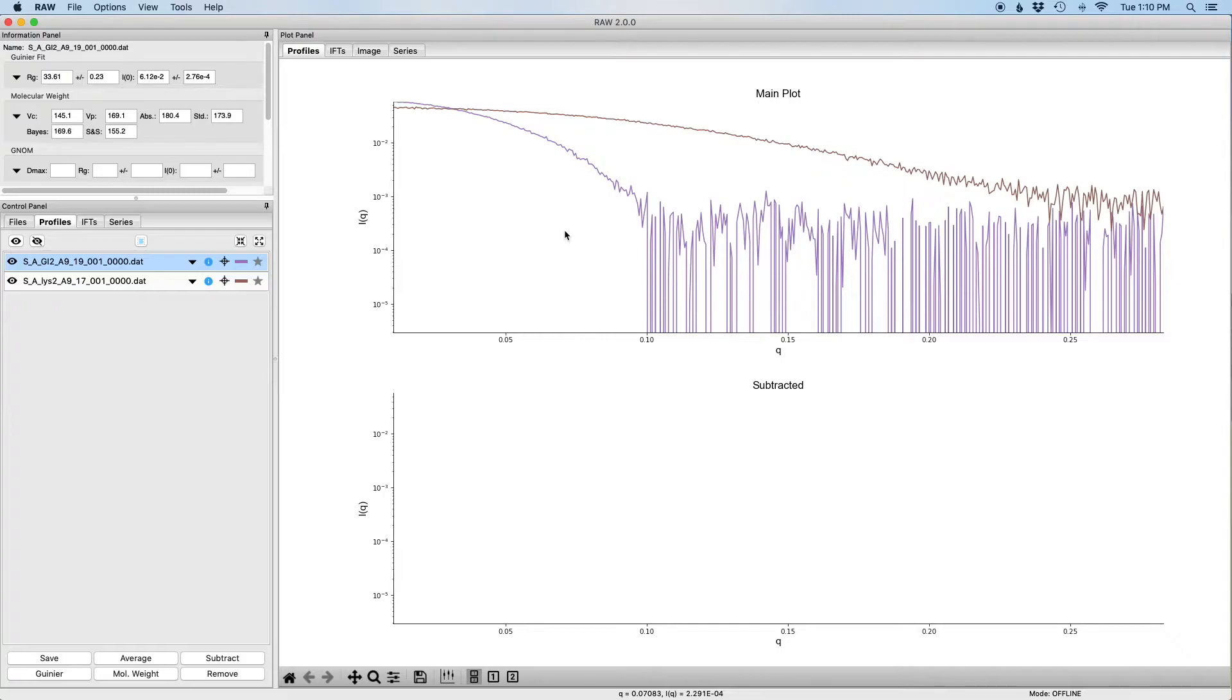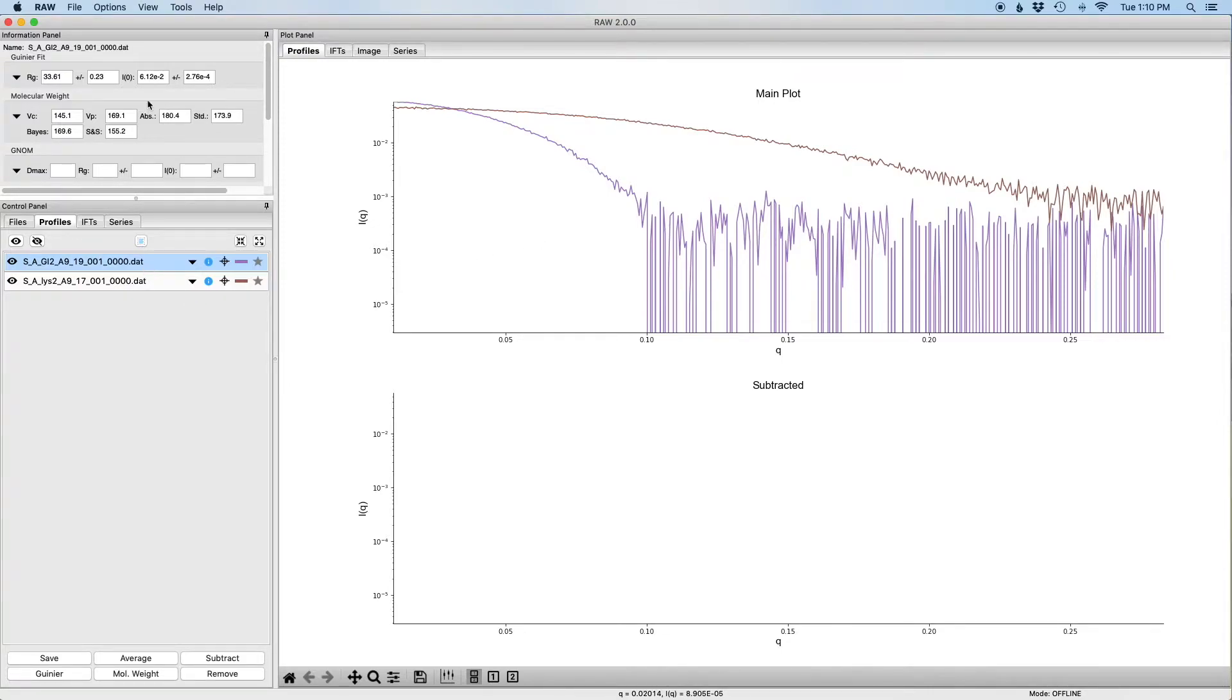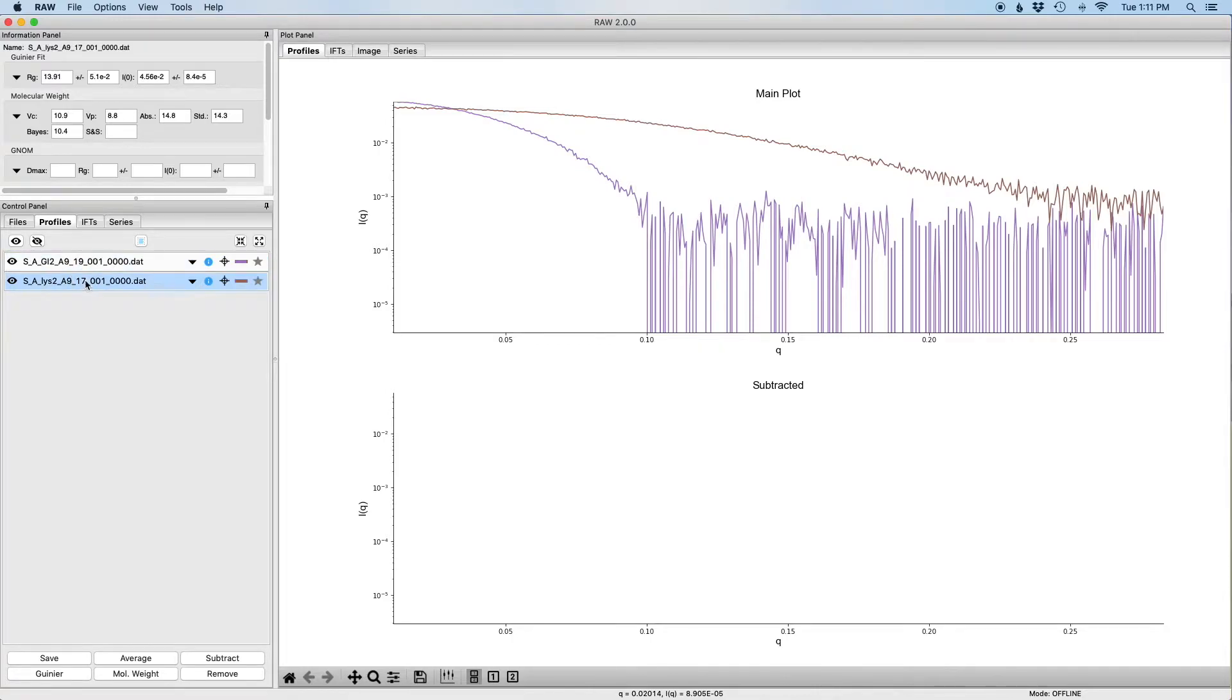If you haven't already done those tutorials, please do those tutorials first and then return to this tutorial. If you have done those tutorials, you should see a screen in RAW that looks like this. Here we have the loaded glucose isomerase data. It's selected, you can see that it has Guinier analysis shown in the information panel.